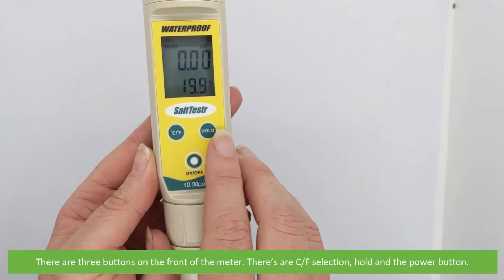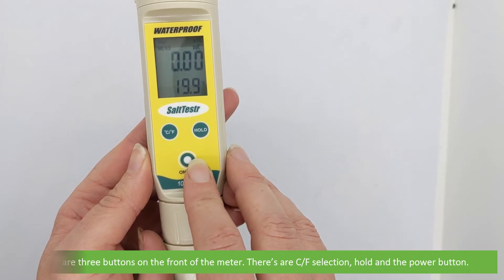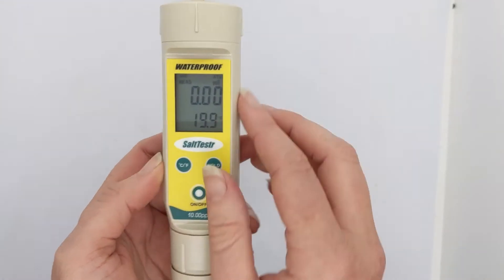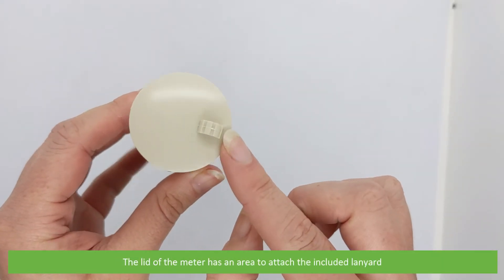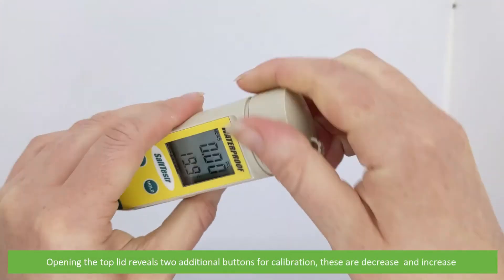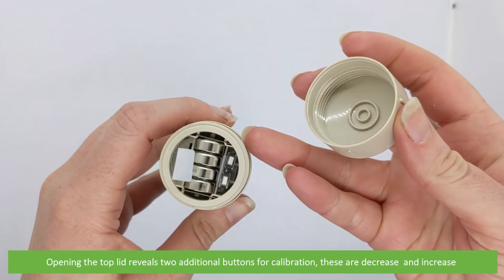There are three buttons on the front of the meter: the Celsius/Fahrenheit selection, hold, and the power button. The lid of the meter has an area to attach the included lanyard. Opening the lid reveals two additional buttons for calibration: decrease and increase.